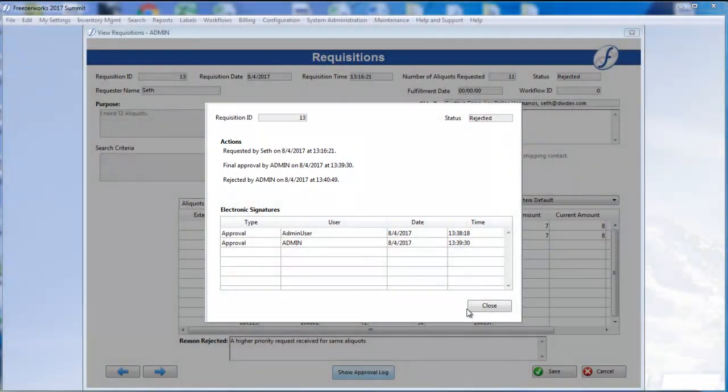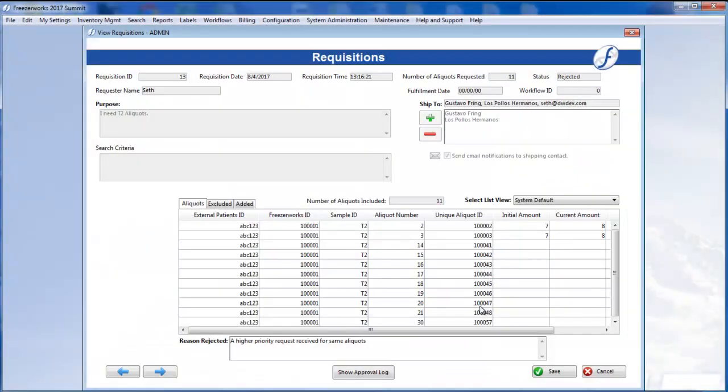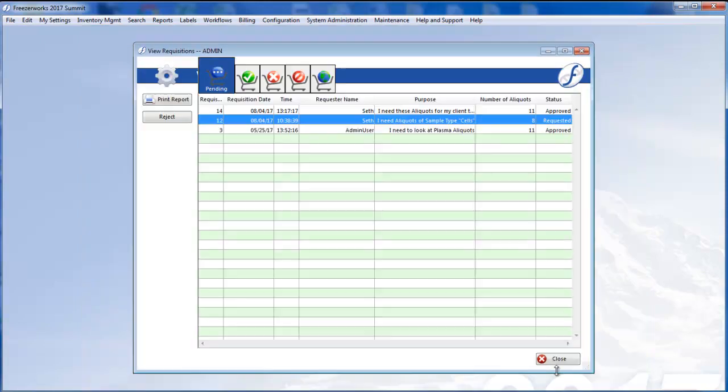To finalize the rejection, click Save. Upon returning to the requisitions list view, you'll notice that the rejected requisition has been moved to the Rejected tab.